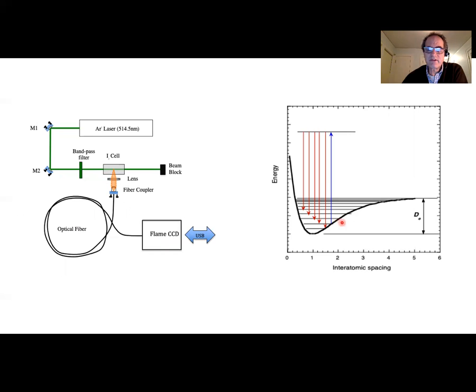And now it's interesting to look schematically at what we're doing when we do this experiment. The system is starting in some initial state, and then the laser is exciting it to some excited state. This is one of the vibrational states associated with an upper electronic state. We don't really need to know the details of this upper electronic state, okay? What we're interested in is the following. When the molecule de-excites and drops back down to the ground electronic state, it can end up in any of the different vibrational states.